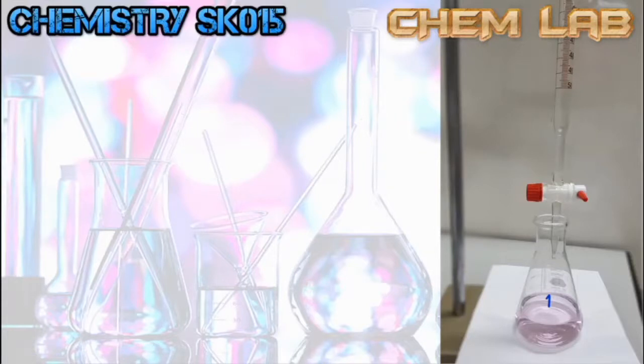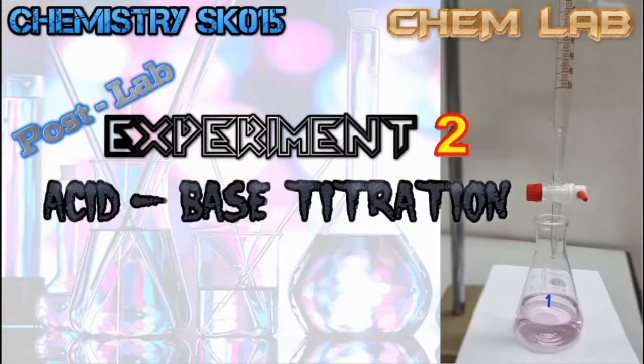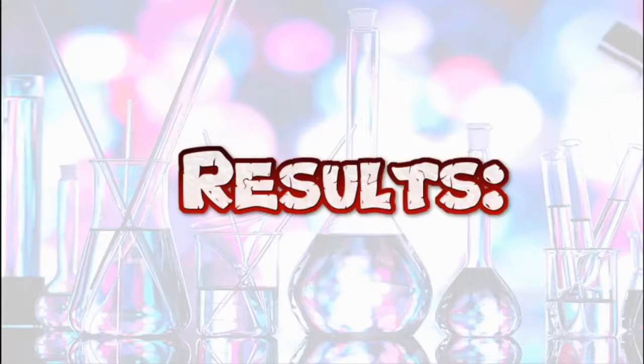Okay, so in today's video we are going to do the post lab for experiment 2, acid-base titration, determination of the molar concentration of hydrochloric acid solution. For the first part of this video, we are going to have a look at the results obtained from this experiment. This experiment consists of 3 parts, part A, part B and part C, and we are going to have a look at the first part.